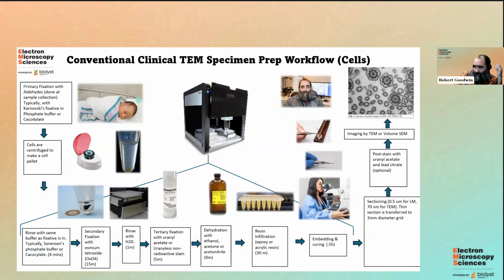And then same thing with the cell pellets. We spin them down in the centrifuge and continue processing.